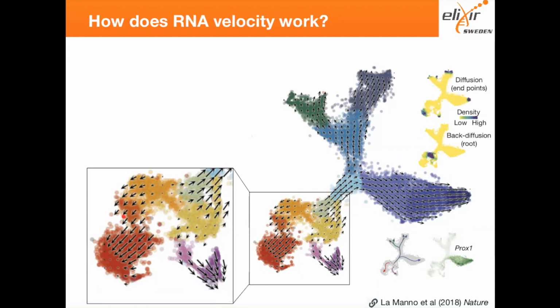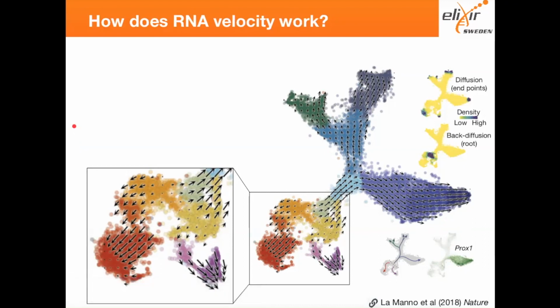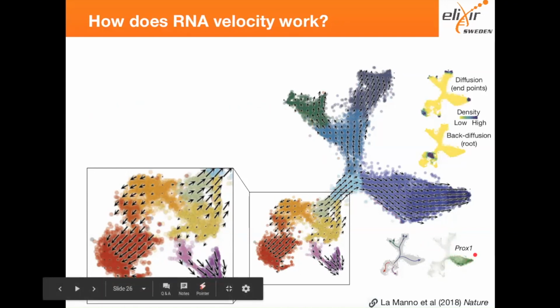And here's just an enlargement of that. So you can see that they start with gaining velocity, so these vectors, until they reach a point in here and disappear. Yes, until the other one as well reaches a top velocity in the end there. And here you can also visualize some other genes in one of the branches that is not expressed anywhere else other than this one.